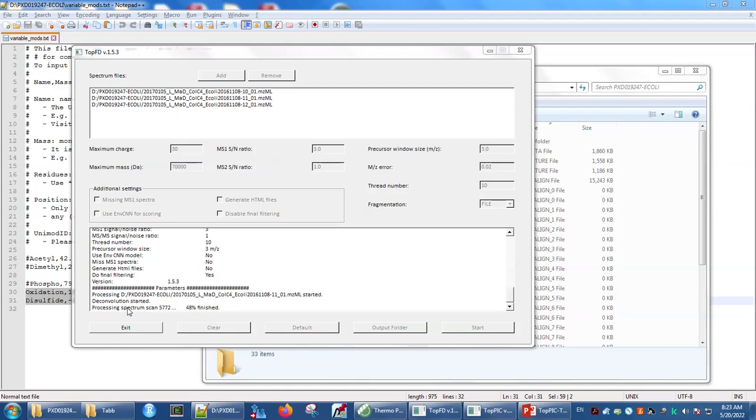These data were collected on an Orbitrap Fusion Lumos, which is not the oldest kind of instrument you might have used for top-down proteomics, but as you can note from the file names, they were collected back in 2017. And 5 years ago, the instruments were not quite as hot as they are today for collecting lots and lots of high-quality tandem mass spectra.